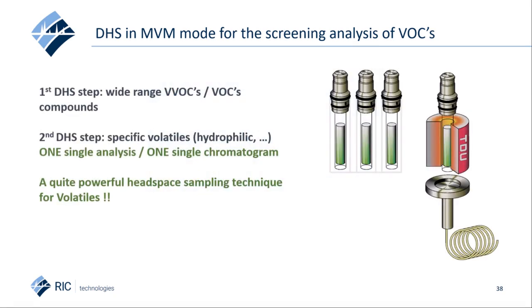And therefore, MVM was taken into consideration here, as we now are able to combine a DHS enrichment step for general VOC screening for compounds easily analyzed by a headspace technique with an additional DHS step implementing the typical parameters, for instance used for epichlorohydrin. Suddenly, we finalize with a more complete VOC screening method covering a wide range of different VOC compounds.